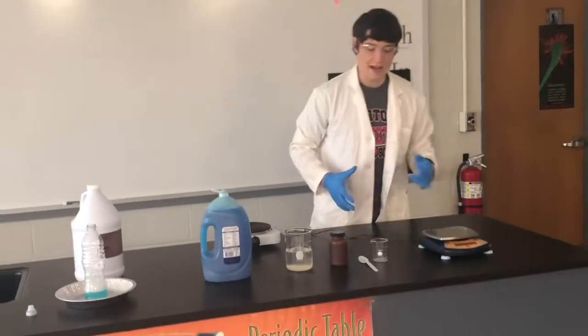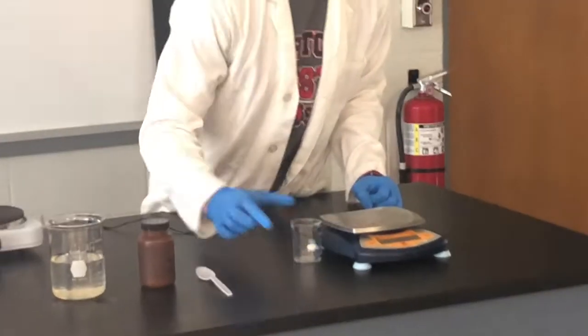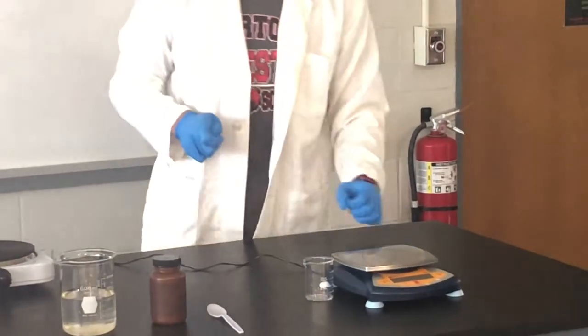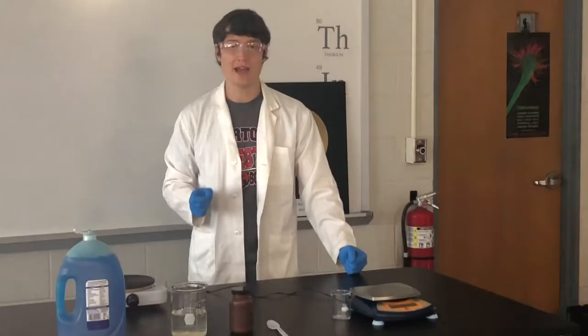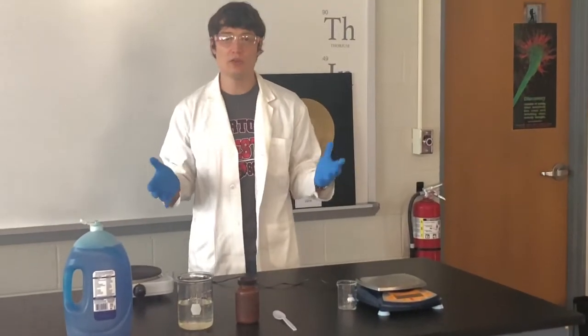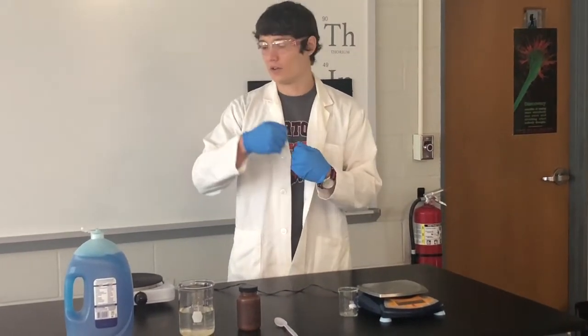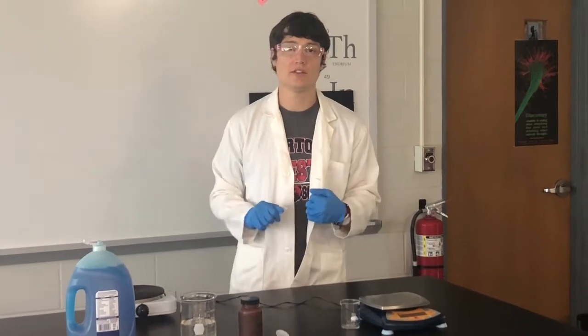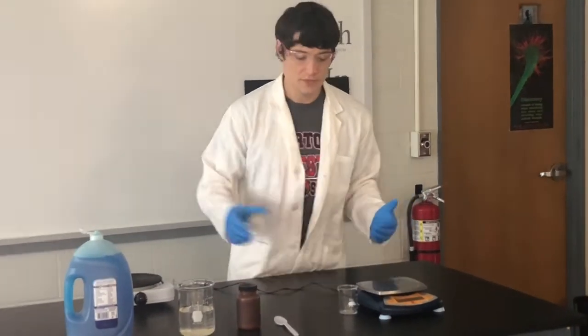Next, I'm going to measure out 15 grams of potassium iodide. I'll be using potassium iodide as my catalyst for this reaction. Now normally, believe it or not, H2O2 normally decomposes in nature. So it's going to, over a long period of time, eventually turn itself into water and oxygen. So the reaction is happening as we speak.